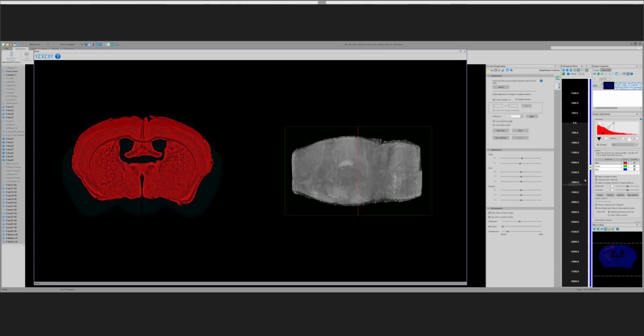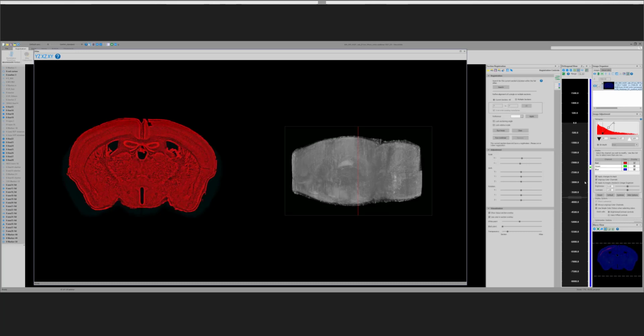So what we're looking for is to try to match, as Nate described, one of the, not problems, but the strategy behind registering a brain that's been reconstructed in this way to the Allen coordinate system is that the sections that we cut are not perfectly orthogonal to the 2-photon block-based imaging that was used to generate the Allen space. And there's compression in the y-axis, and that can be adjusted both by doing an atlas calibration, but can also be adjusted when we do the registration here.